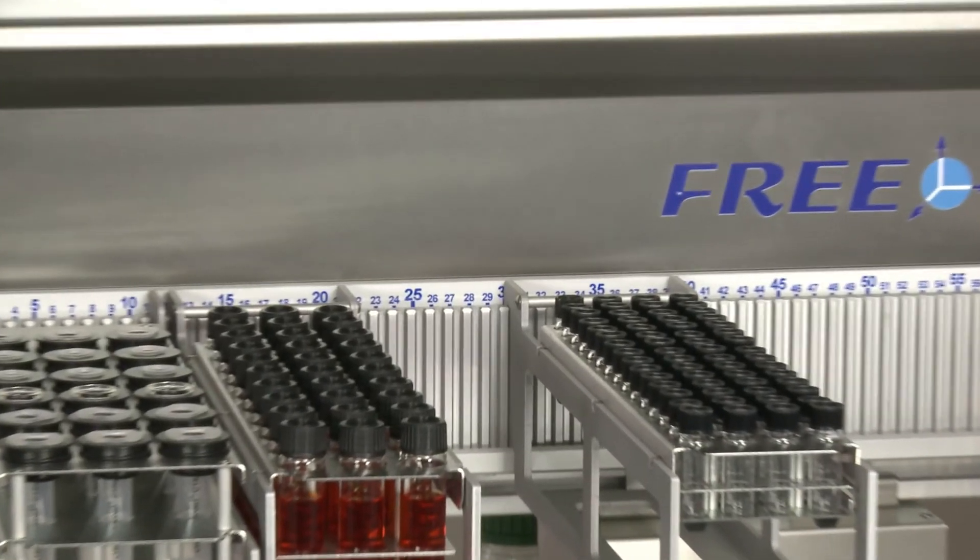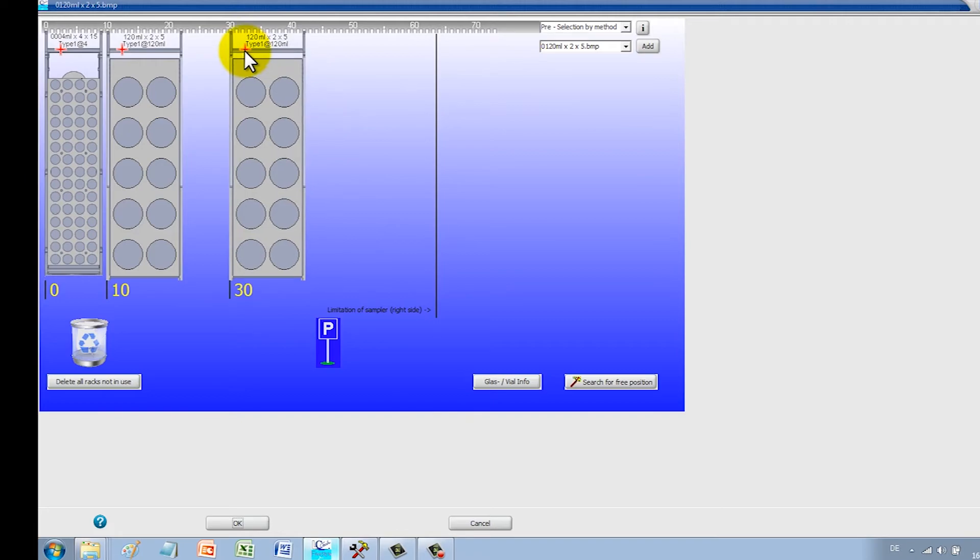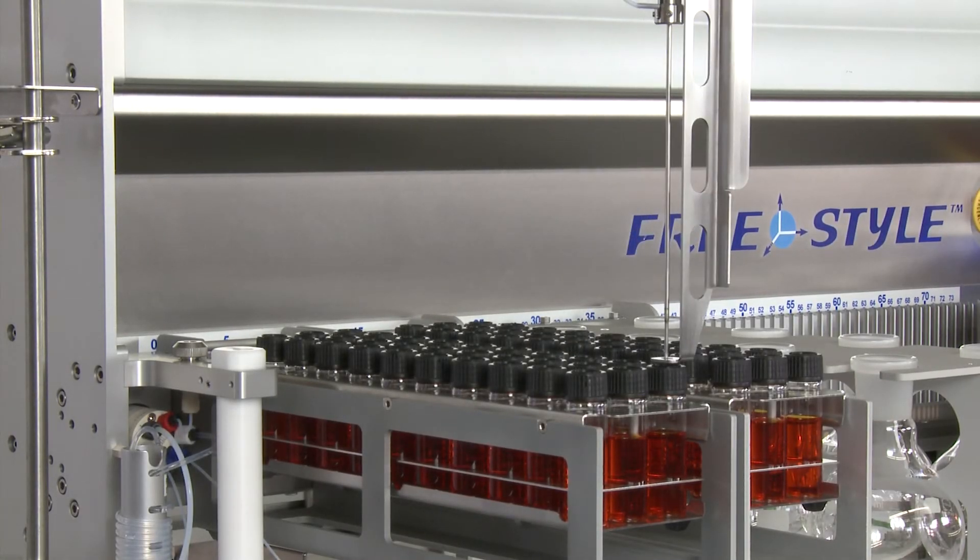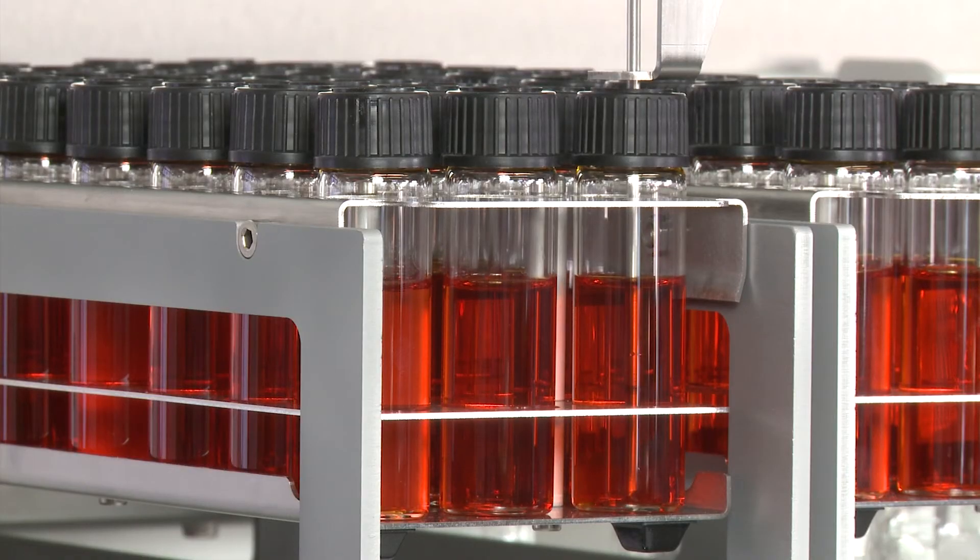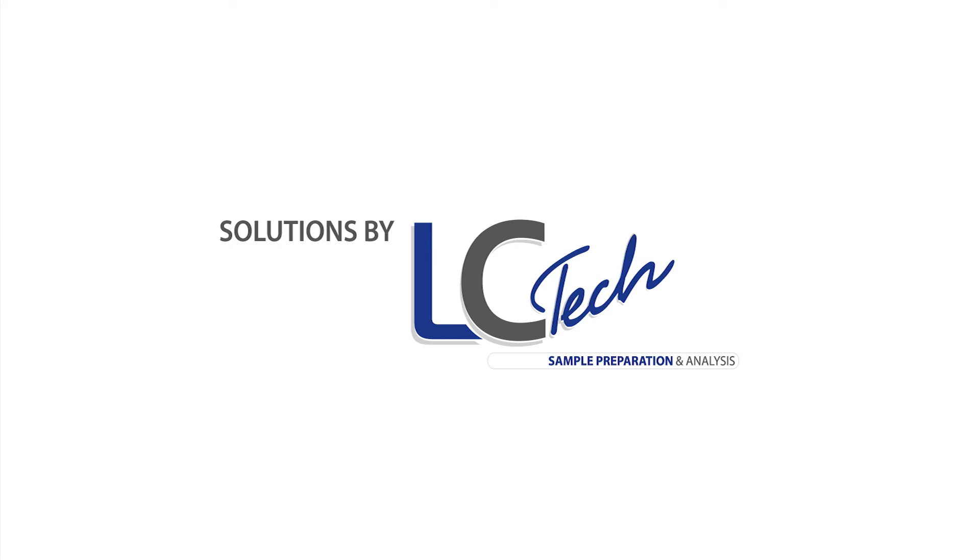The racks are fitted in no time, and are logged into the software with only a few mouse clicks. The Freestyle GPC. Automated sample preparation by LCTech.